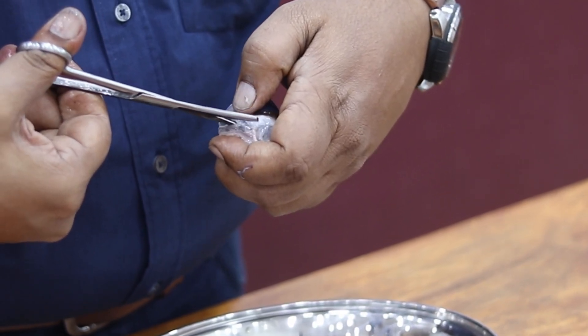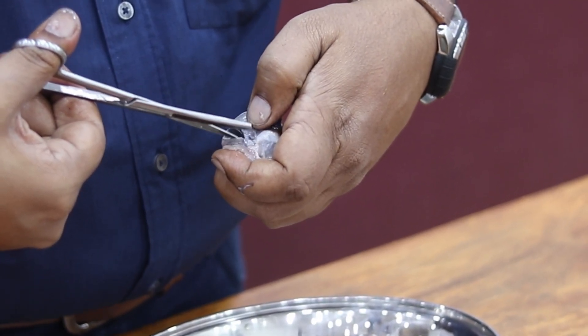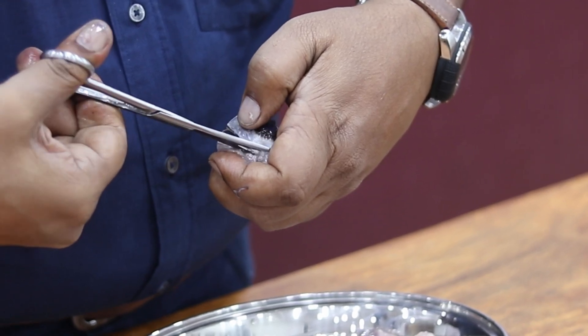The transparent fluid present inside is going to ooze out now. I'm touching it — it's very soft.